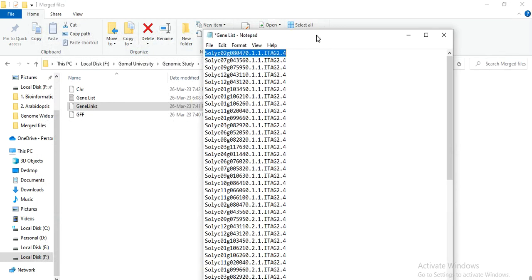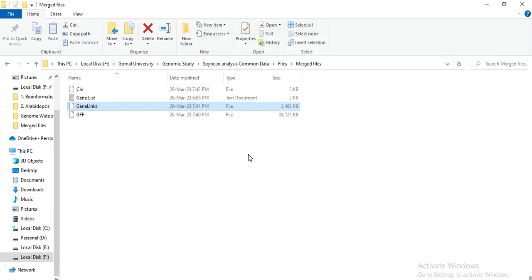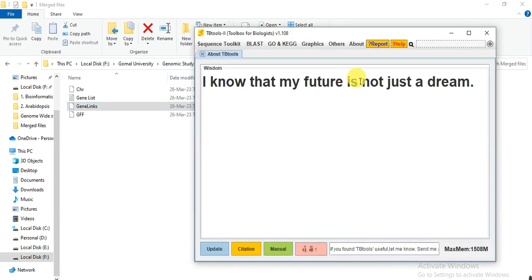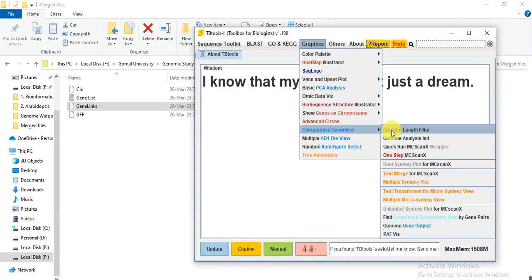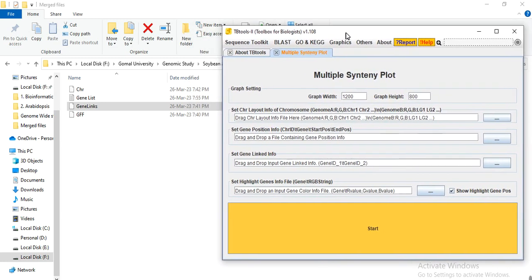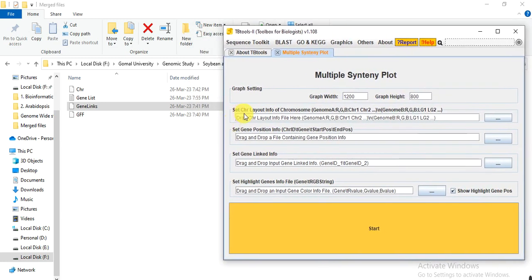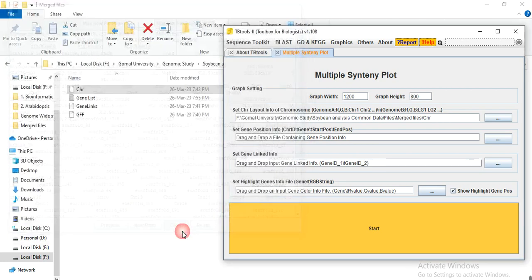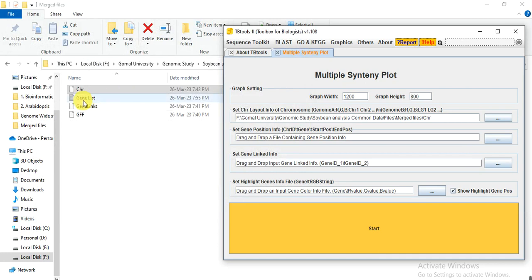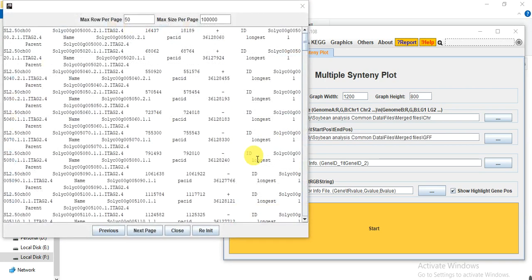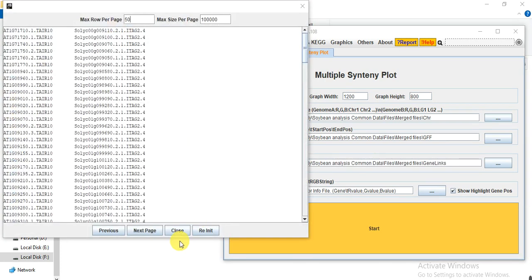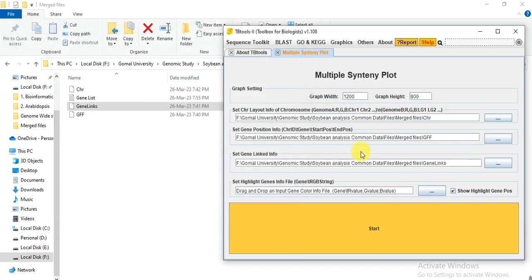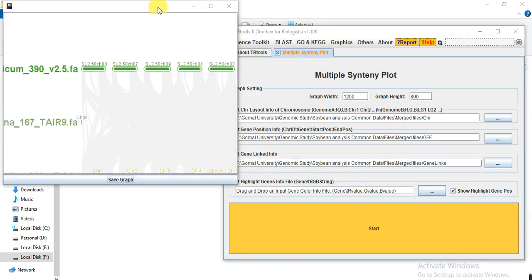So after making similar names, now we go to open the TBtools. Go to graphics, comparative genomics and multiple syntenic plot. So here we can see this is the set chromosome layout info. So here is the chromosome file, match file, and gene. This is the set gene position info, GFF file that we have got from the match files, and here is the gene link file info. So first we check it. Start. Press.